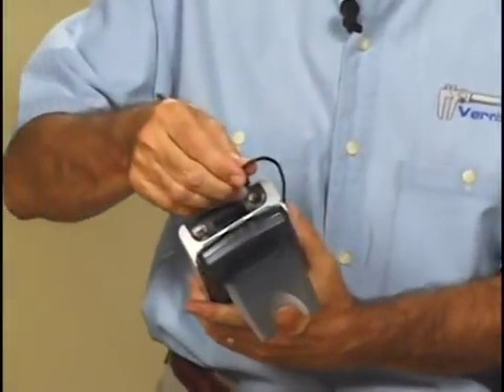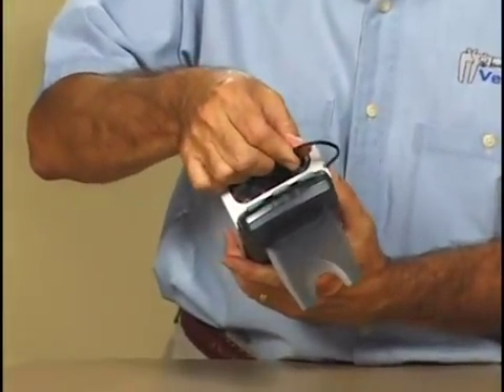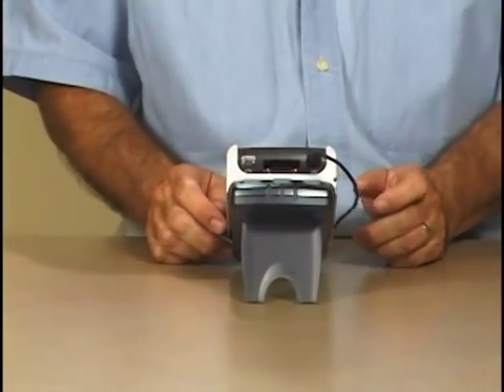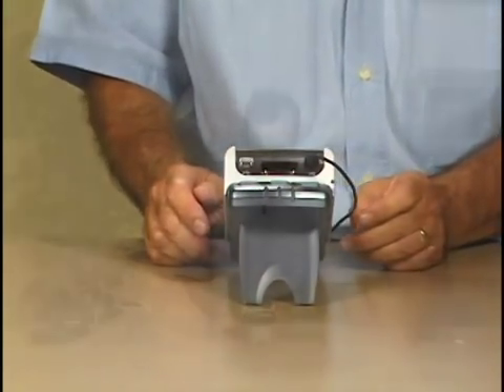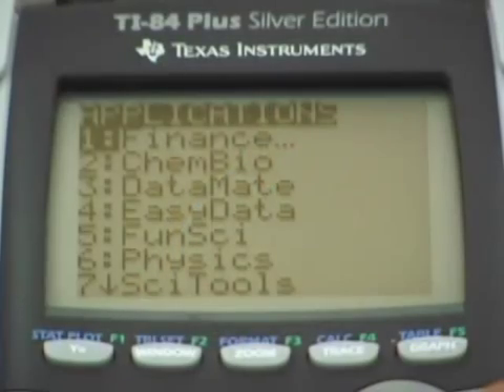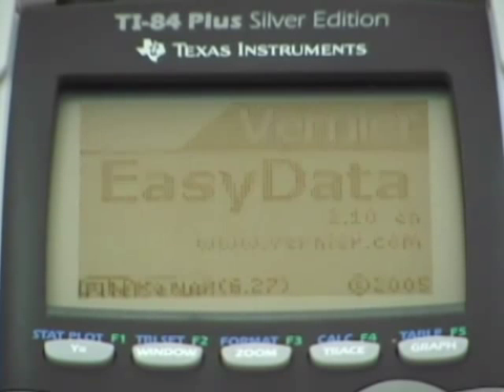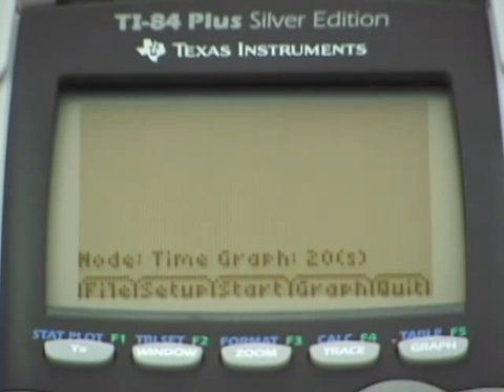Connect the other end into the top of the TI-84+. Then we're ready to start the EasyData application. All we do is press the Apps button, scroll through the list of applications on the calculator until we find EasyData, and press the Enter key. EasyData will start up. In this case, the screen is blank because it has not found a sensor.